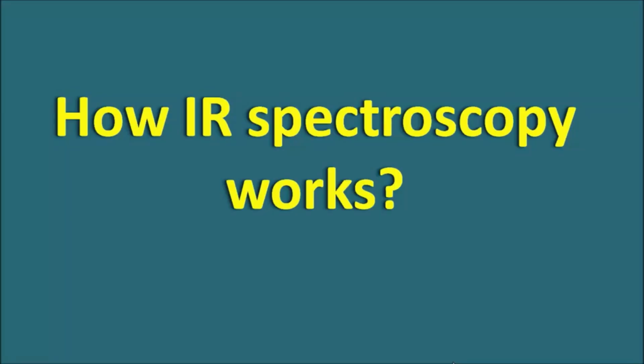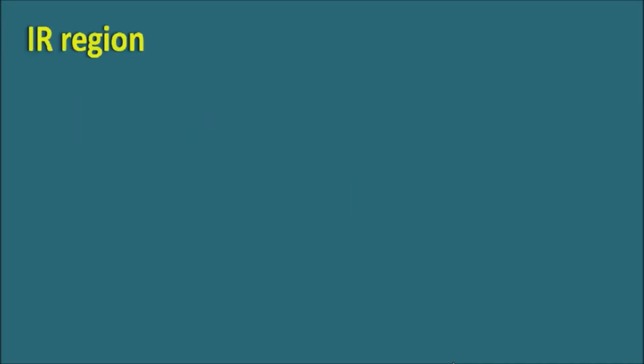Hi everyone. Today in this video we are going to discuss how IR spectroscopy works and what is the principle involved in IR spectroscopy. First of all, let us start with the IR region. What is the IR region?